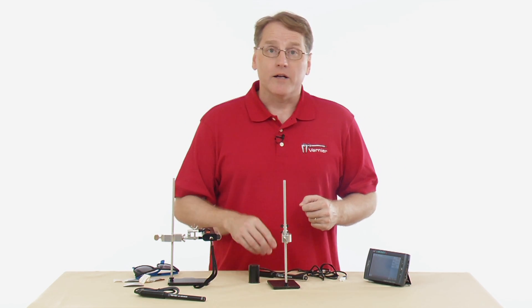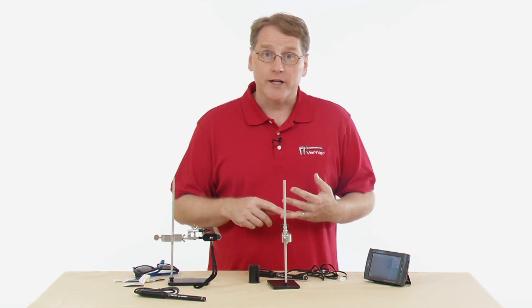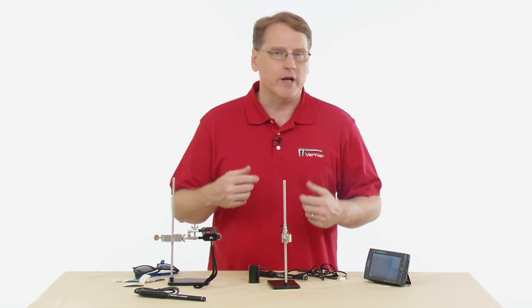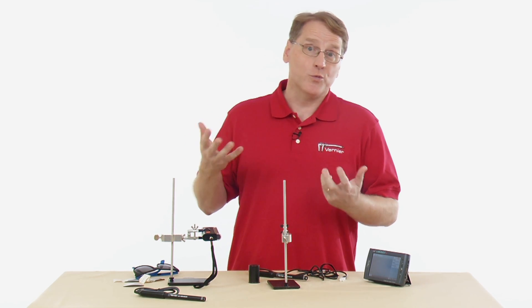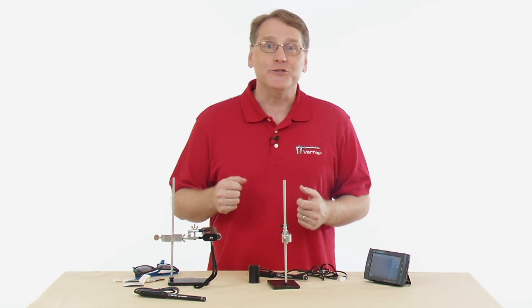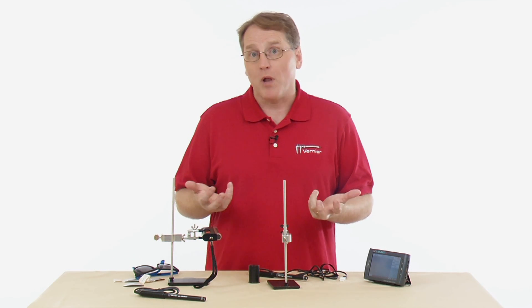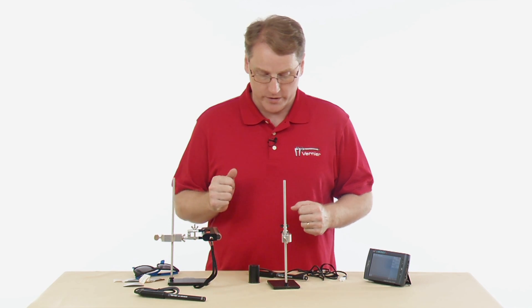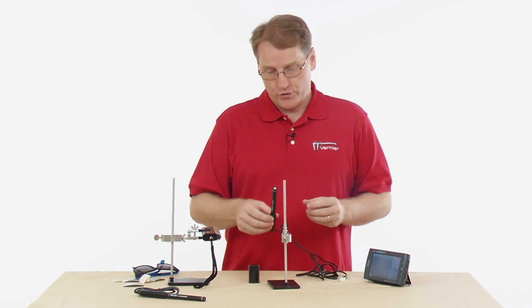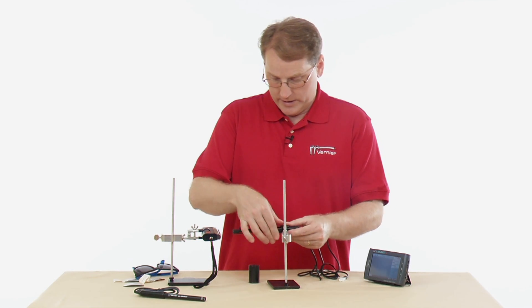These sensors are used in several labs — in the environmental book and in the earth science manual — where you're looking at UV radiation. There's a nice sunscreen lab, and there's one using sunglasses where you can test different lenses and see how much UV radiation is blocked by various lenses. It's an easy demonstration of how this device works.